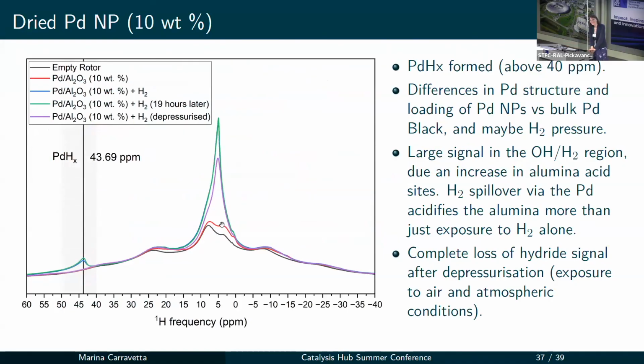If you alloy the nanoparticle, you can influence that quite considerably. So I'd be very interested if you could do something more on palladium hydrides, because alloying the palladium, for example with tin, is catalytically very interesting for making hydrogen peroxide. It would be interesting to follow that way, and the tin certainly influences the amount of hydride that you can form. Sorry, it's a long comment.